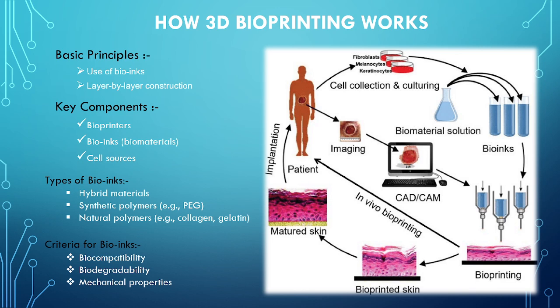So bioink is nothing but a pool of cells, where all the cells are collected inside a biomaterial. So what do you mean by biomaterial? Biomaterial is an environment we created for these biocells in order to survive, right? So we have a well safe environment for these collected and cultured biocells, so that they can develop into a tissue and then an organ, right?